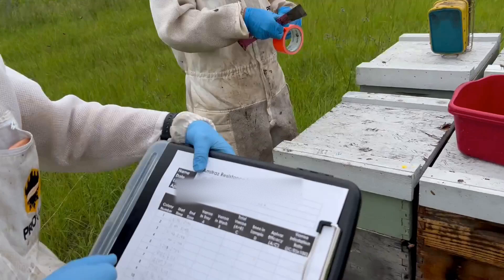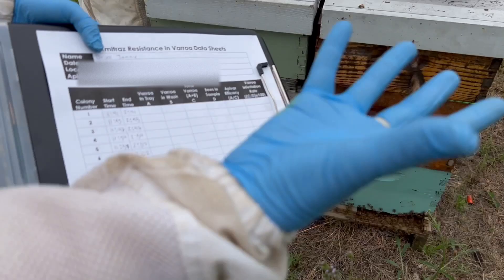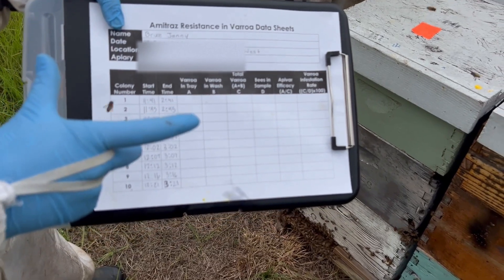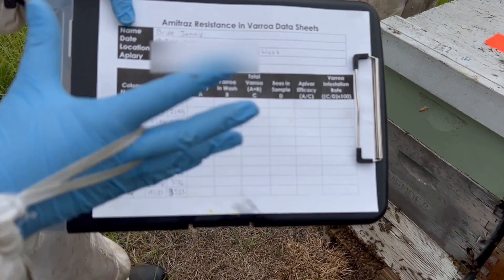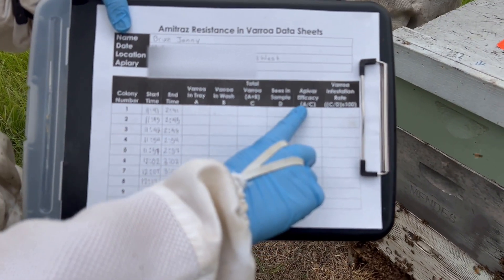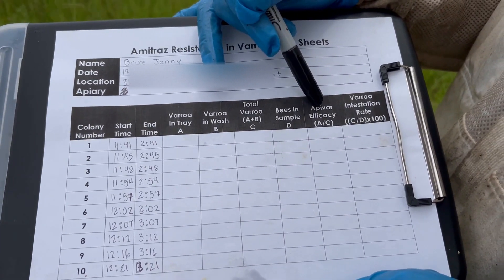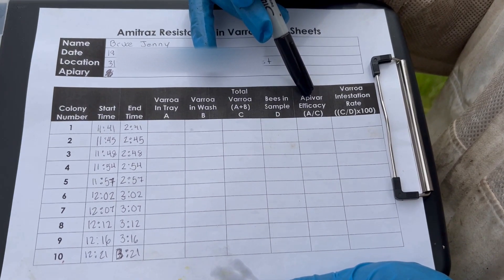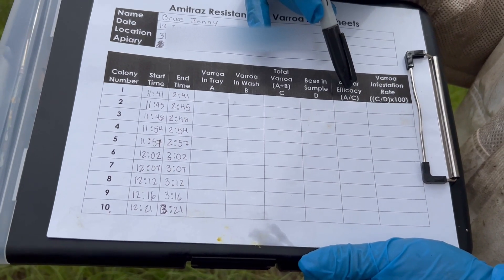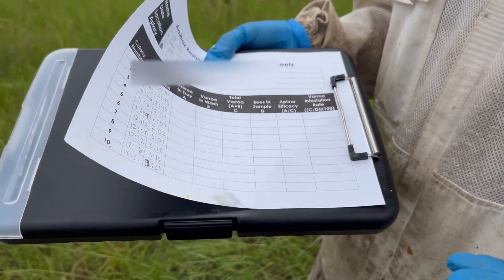So we did all 10 of our little samples. This is the start time that the bees were put into the cup, and then this will be the end time when we flip the cup over. This column will be the amount of Varroa mites in the Vaseline. Then when we do the alcohol wash, we'll count the amount in that as well — this will be the total. Then it's the Apivar efficacy: we divide the Varroa in the tray by the total Varroa, and that gives our efficacy percentage. Generally the threshold is 70% efficacy — we want better than 70%, which means Amitraz is still pretty effective within your colonies.